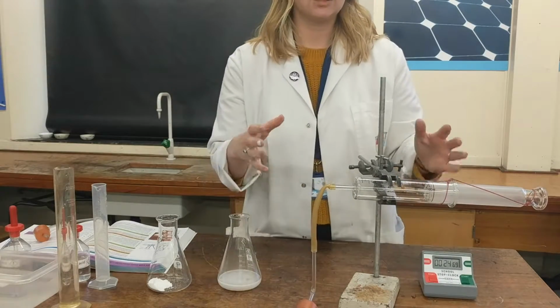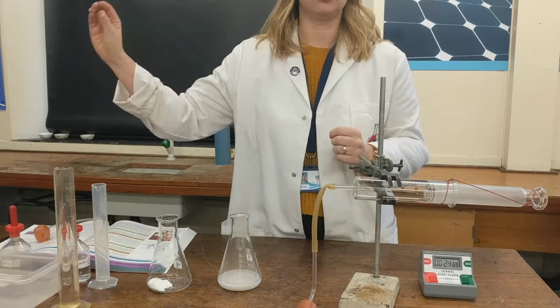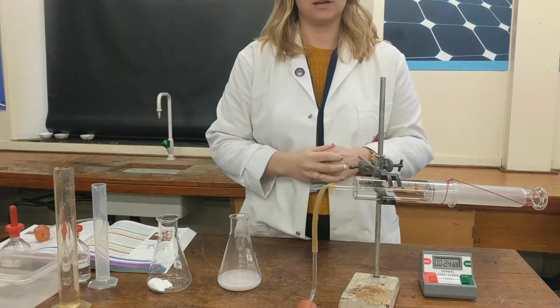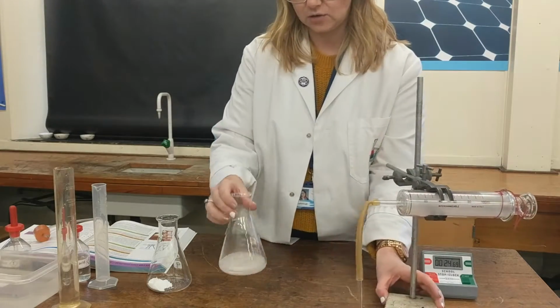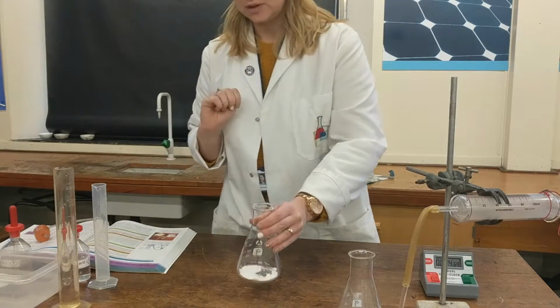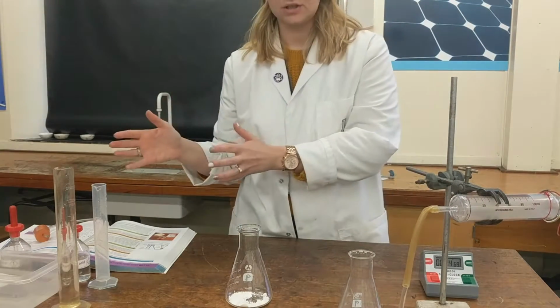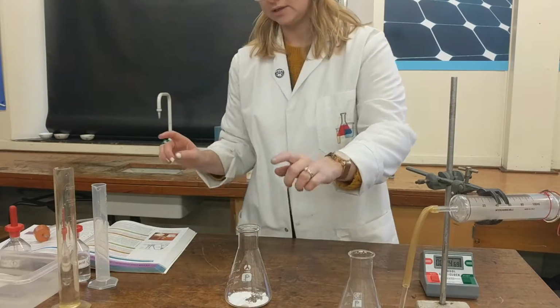What would happen when you've got to the end of it and you've still got more time? You would just max out 100, 100, 100, 100 in your results table, and you would see that it would plateau out to show you that that is the end of the reaction. Okay, so that's using the gas syringe. That's obviously still reacting and fizzing away, you can hear that. The other one is with the powder. When you're doing your core practical, whichever one you decide to use, you must stick with for both. I'm just doing this to show you how both work today.